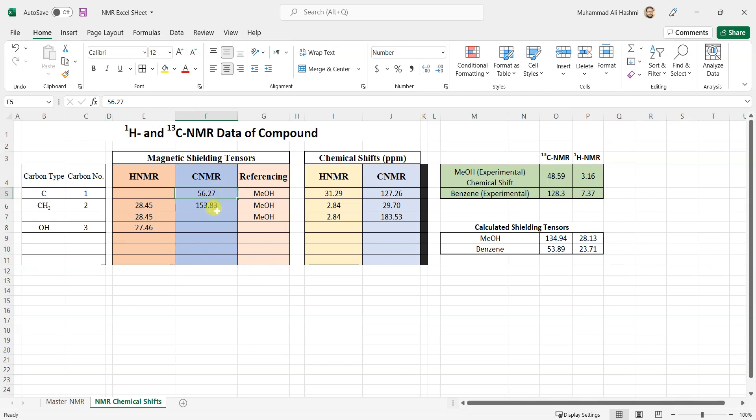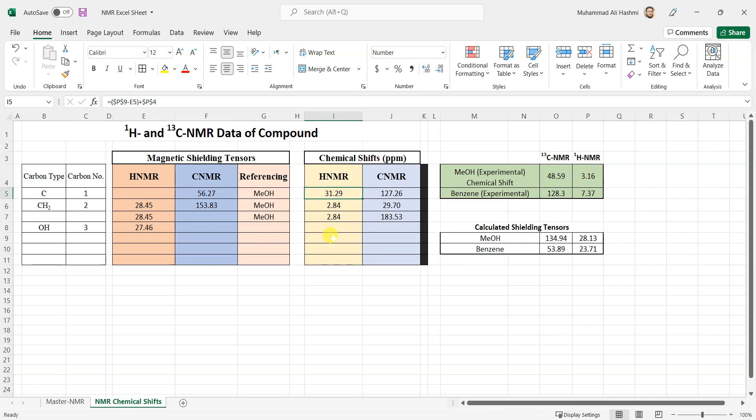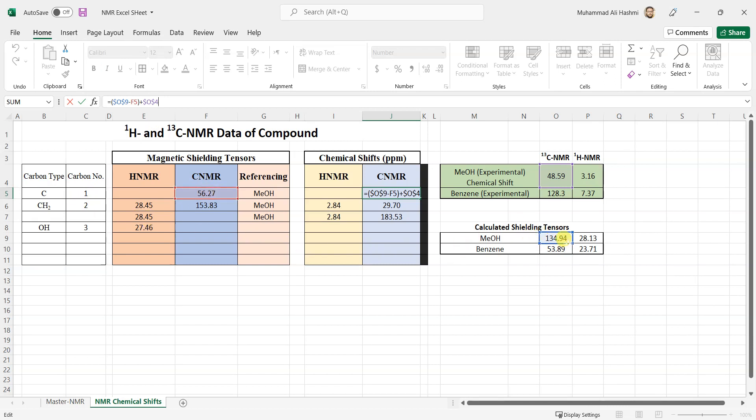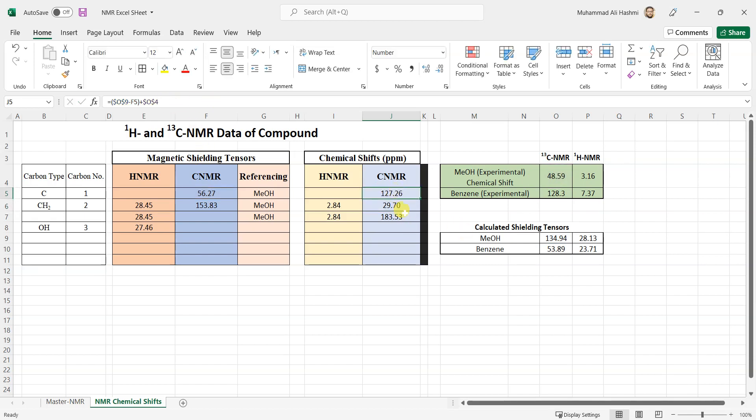Here is the C13 shielding tensor and here are the proton shielding tensors and you can see that the sheet is calculating the chemical shift values for both. For C13 it's this one. What it is, I'll just show you the formula. It's basically this one, this is the calculated shielding tensor of methanol minus F5 which is the calculated shielding tensor of the carbon in your compound. So you subtract the shielding tensor of your carbon from the solvent and then you add the experimental chemical shift value of the solvent and you will get the chemical shift value of your calculated compound.